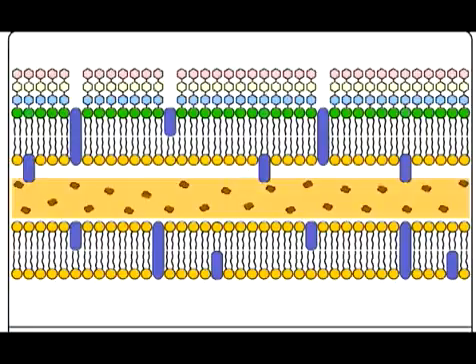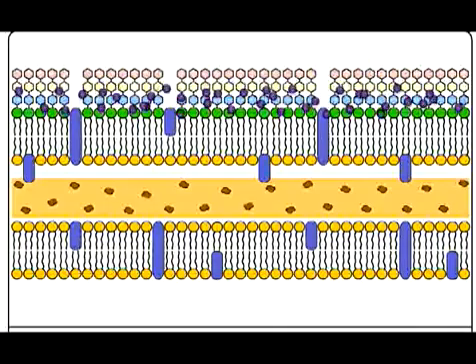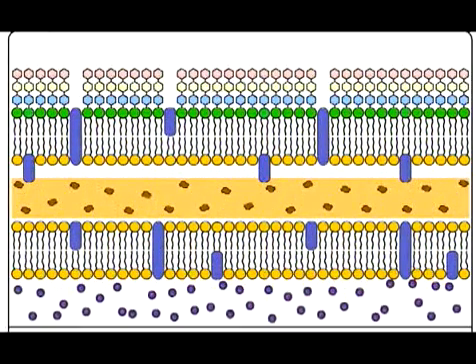Alright, now let's have a look at a gram-negative bacteria. The first thing you'll notice is that the peptidoglycan layer right here is much thinner than in the gram-positive, but you'll also notice that there's this outer membrane. But we've added crystal violet just as before. You can see the crystal violet molecules, and when they're added, they'll move through that outer membrane, through the thinner peptidoglycan layer of this gram-negative bacteria, and through that phospholipid bilayer, and again they will be stuck.